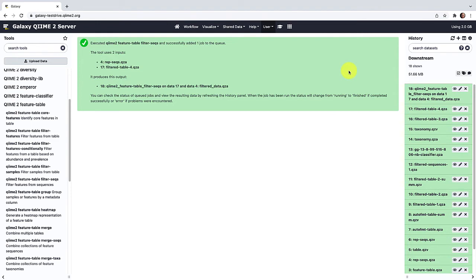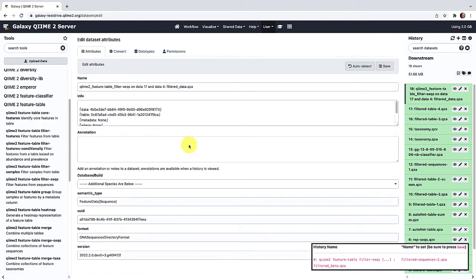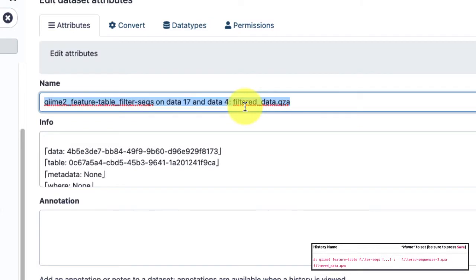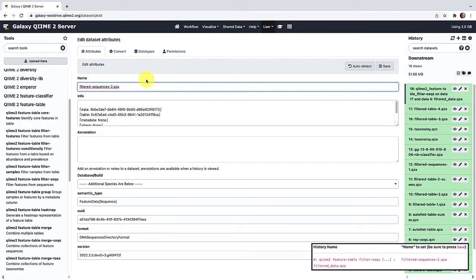Now that QIIME 2 has finished filtering out our excess ASVs, let's go ahead and rename this file. We're going to call this one filtered-sequences-2.qza and click Save.